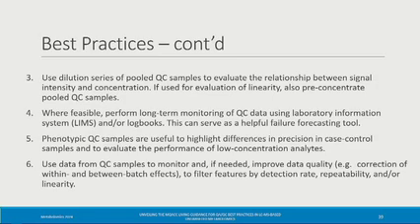Yeah, I was looking at the pre-concentration. Oh, there it is. I'm just curious about that because, of course, when you pre-concentrate your pooled QC, you are doing something to that data point that you don't do to anyone else. So that actually introduces more variability. I'm not quite sure whether doing a pre-concentration of the pooled QC would actually affect the linearity data. It's already questionable what is linear, right?